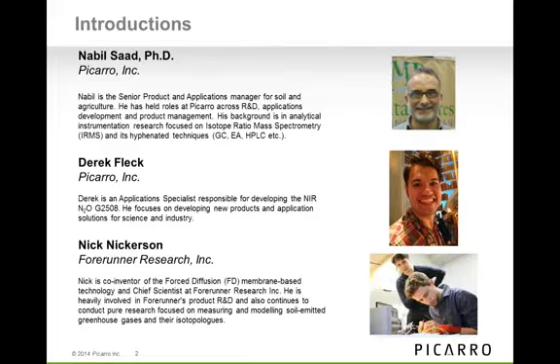Today I have the pleasure to introduce my colleague, Derek Fleck, who is a presenter within this webinar. Derek is an application specialist at Picarro, and he was involved in the team for the development of the NIR G2508 system that is capable of analyzing concentration species. This is part of his presentation that will show the comparison between the Picarro G2508 and the gold standard of gas concentration measurement for soil application, which is the gas chromatograph.